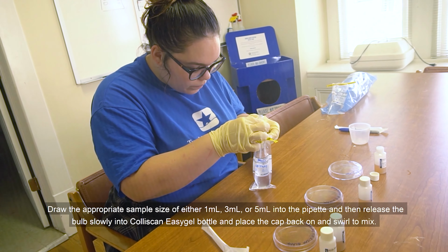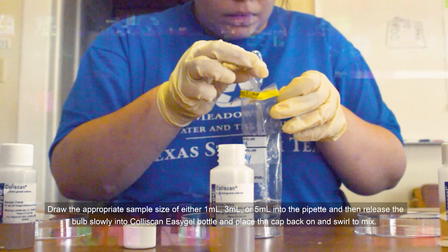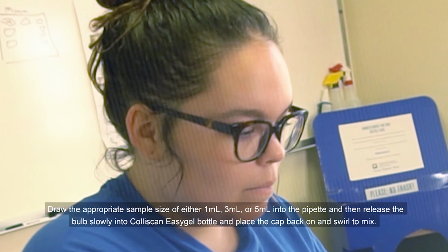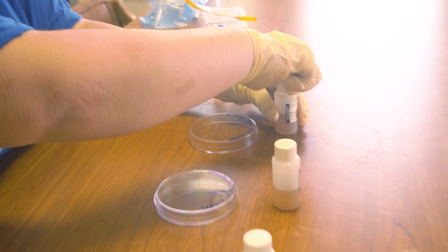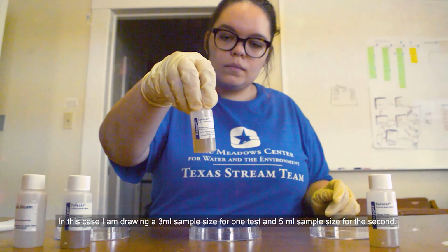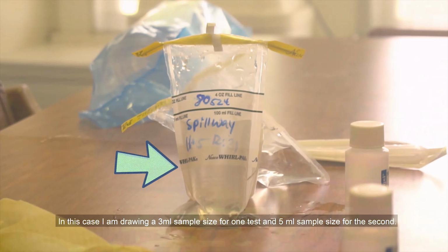Draw the appropriate sample size of either 1 milliliter, 3 milliliters, or 5 milliliters into the pipette, and then release the bulb slowly into the Coliscan Easy Gel bottle and place the cap back on and swirl to mix. Each sample size drawn will go into a new Coliscan bottle. In this case, I am drawing a 3 milliliter sample size for one test and 5 milliliter sample size for the second. Record the sample sizes on the Texas Stream Team monitoring form.